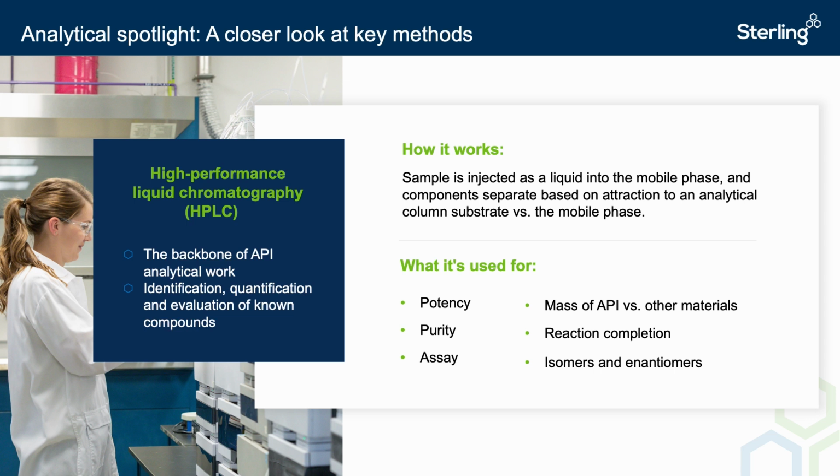DAD detectors are also very useful for evaluating peak purity during forced degradation and stability studies, because they can prove that there are no compounds co-eluting with the main product across a wide spectrum of wavelengths.